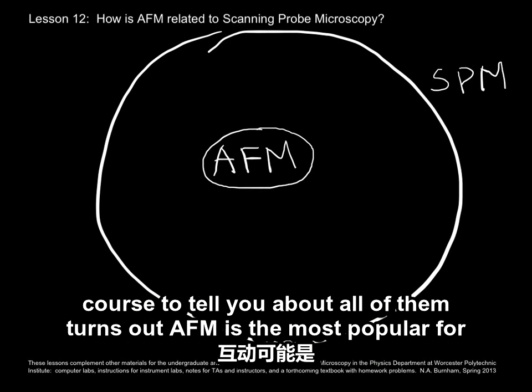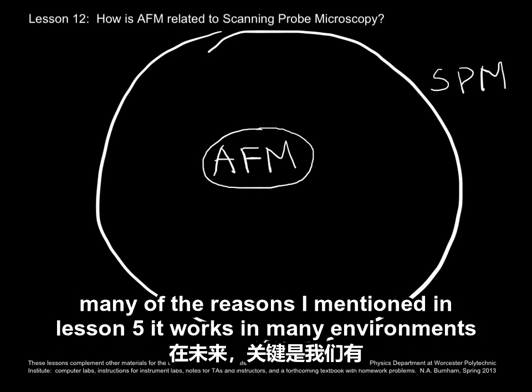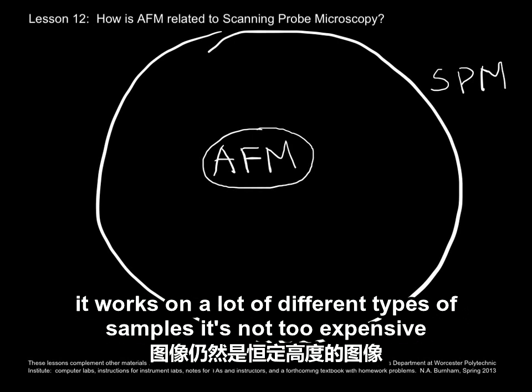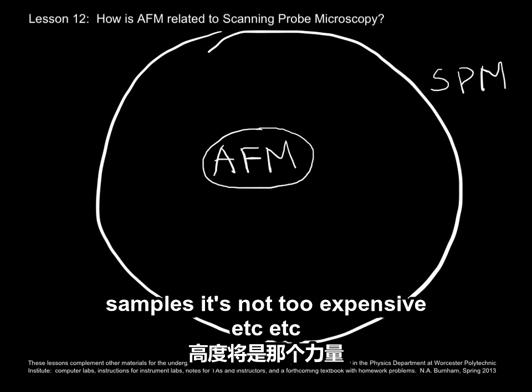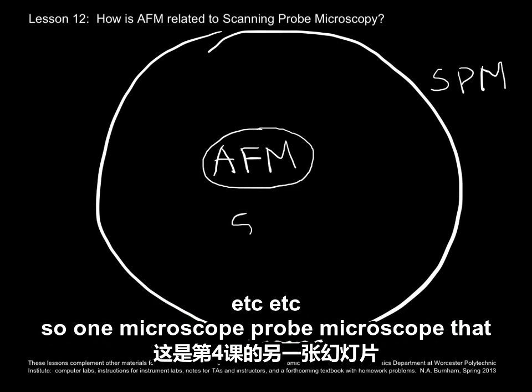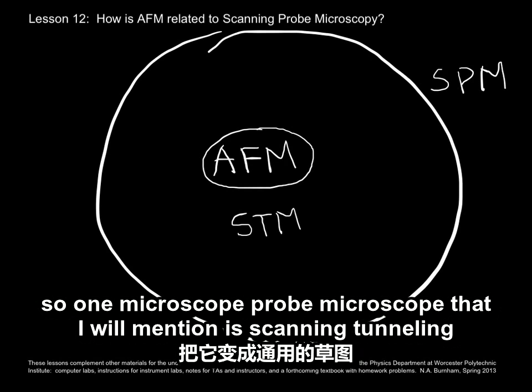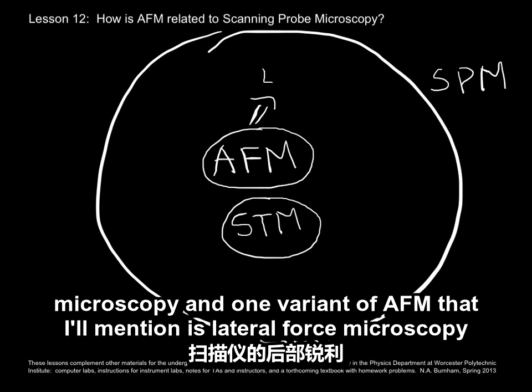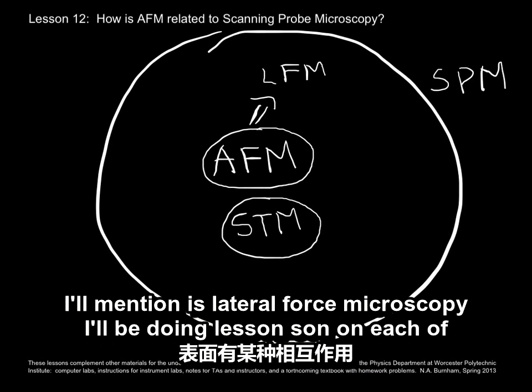Turns out AFM is the most popular for many of the reasons I mentioned in lesson 5. It works in many environments, it works on a lot of different types of samples, it's not too expensive, etc., etc. So one probe microscope that I will mention is scanning tunneling microscopy, and one variant of AFM that I'll mention is lateral force microscopy. I'll be doing lessons on each of these.